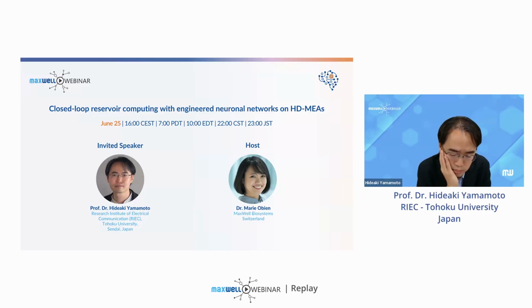Good point. So we plate the neurons at the same concentration, and so in that case, the number of neurons should more or less be the same. But since there's an effect of the PDMS inhibiting the adhesion to those regions, I could suspect that the homogeneous networks have a larger number of neurons compared to the patterned networks.